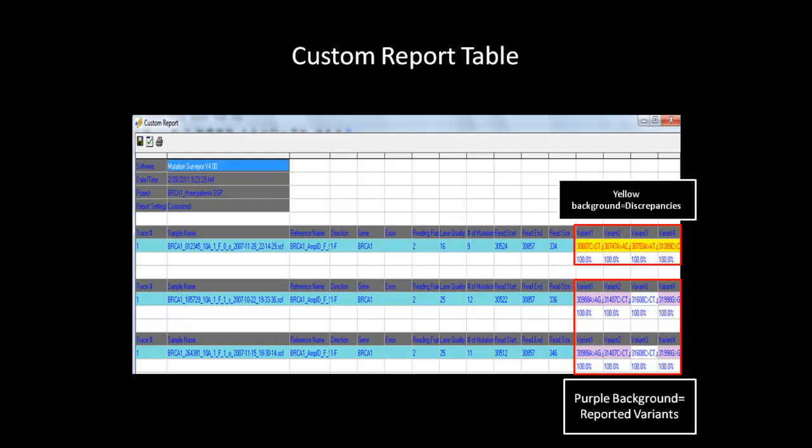If you lose the mutation table while reviewing the data, hold CTRL and press T to bring the table back up and review other discrepancies if needed. By default, purple background indicates reported variants, blue text in the report indicates high confidence, while red text indicates low confidence mutation calls. The color coding in the custom report is all customizable and can be changed in the settings.